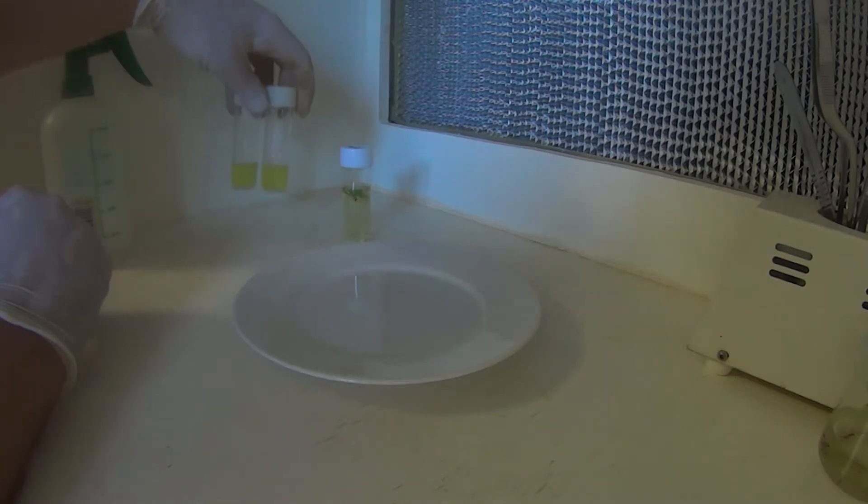Now the media, as I mentioned before in the other Venus flytrap video, has kinitin. This media has a bit of kinitin added to it to try and help that callous form. So that's why it's dyed yellow.